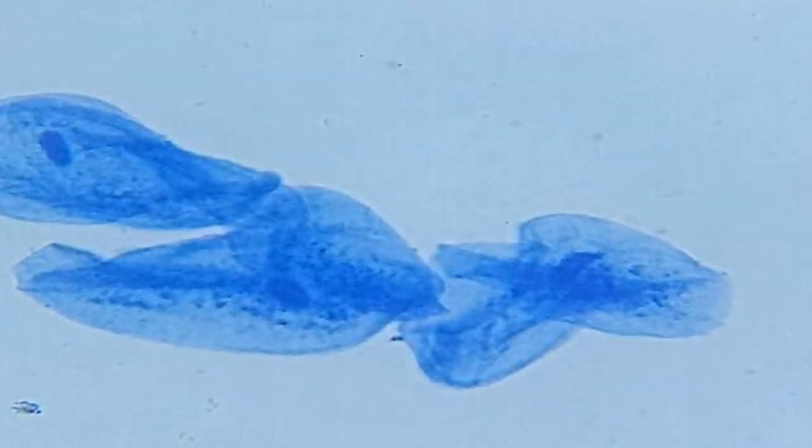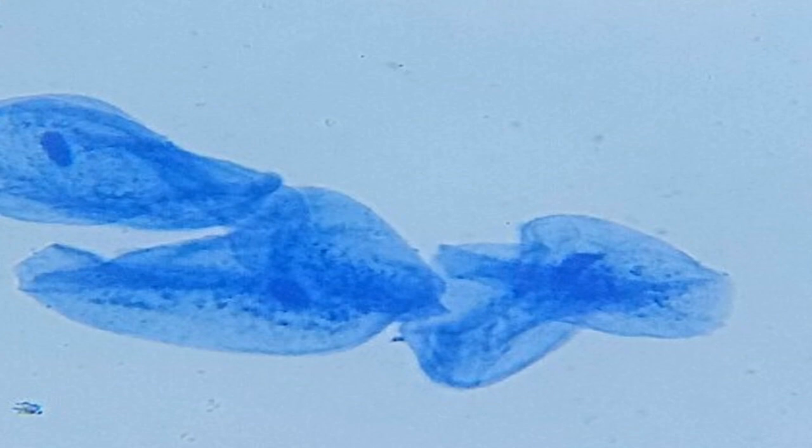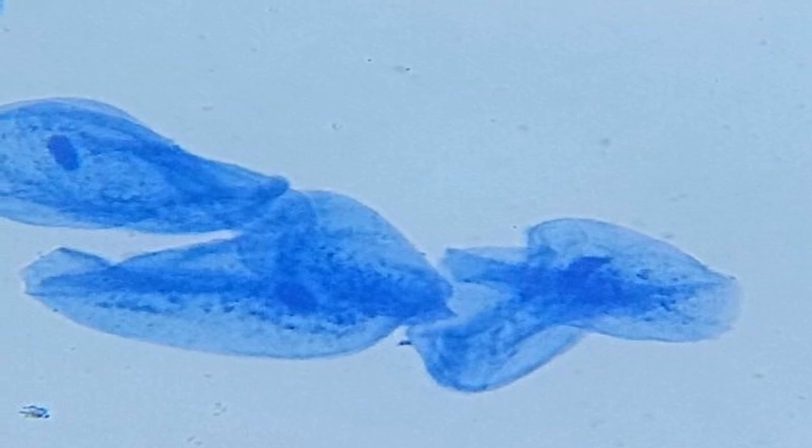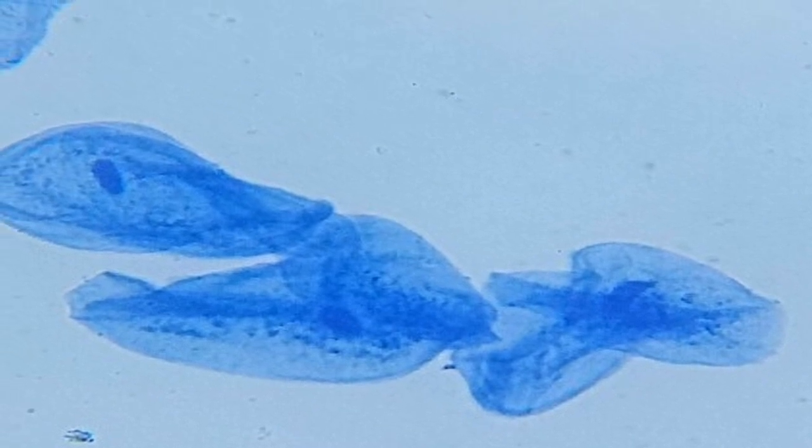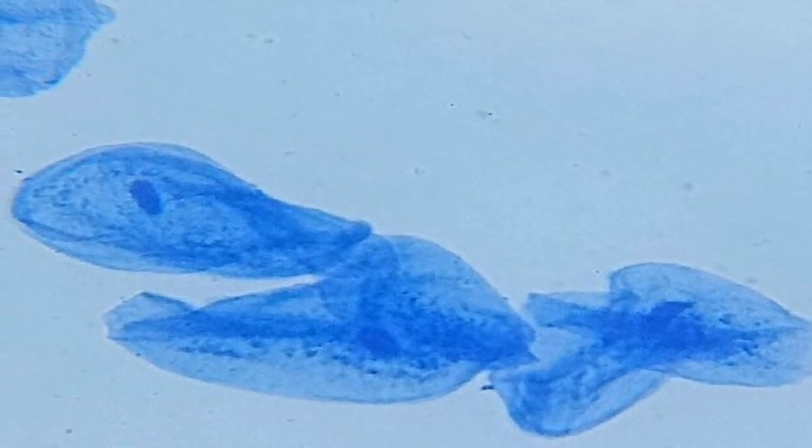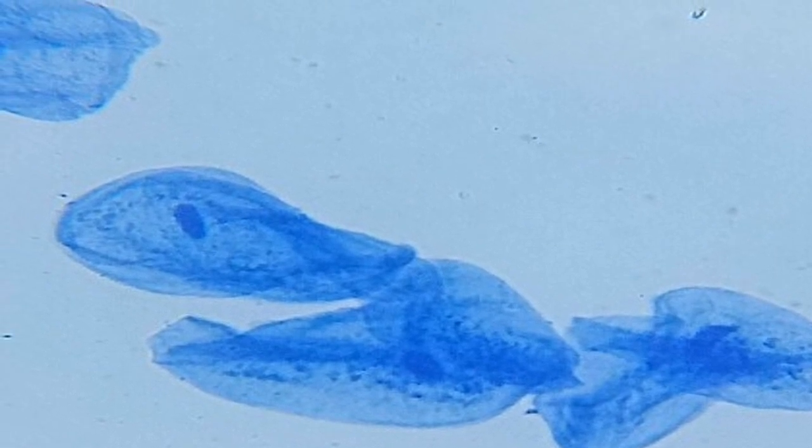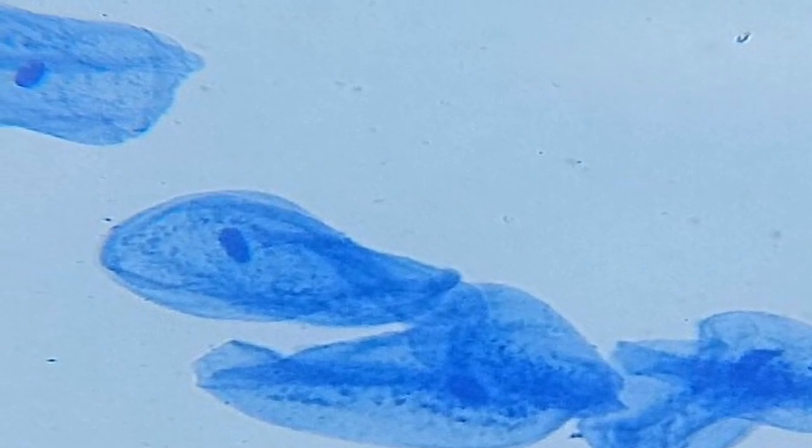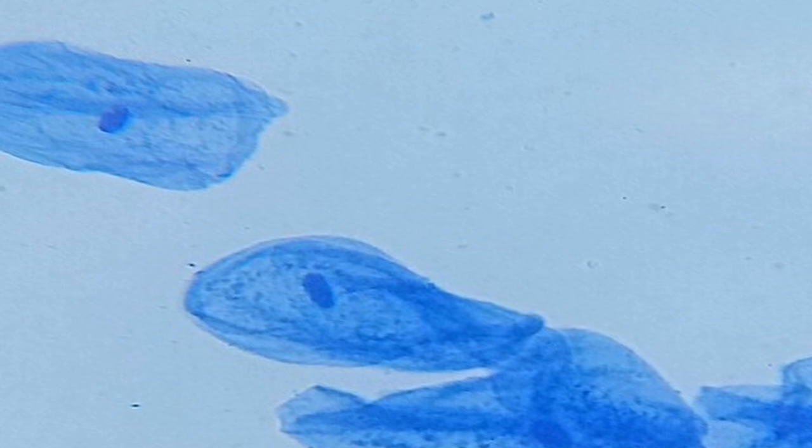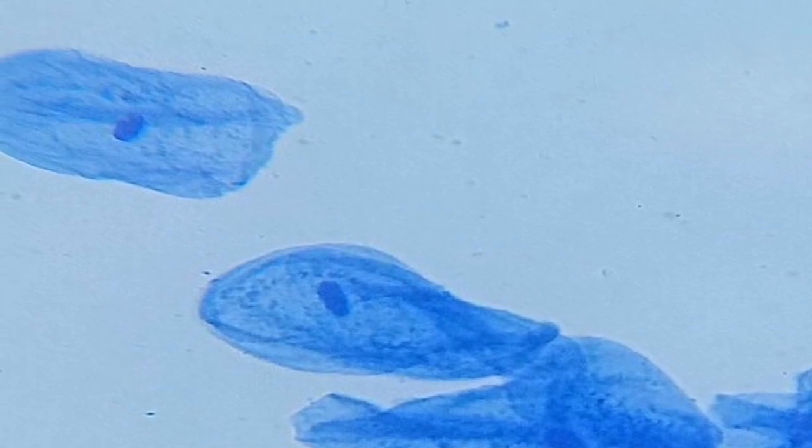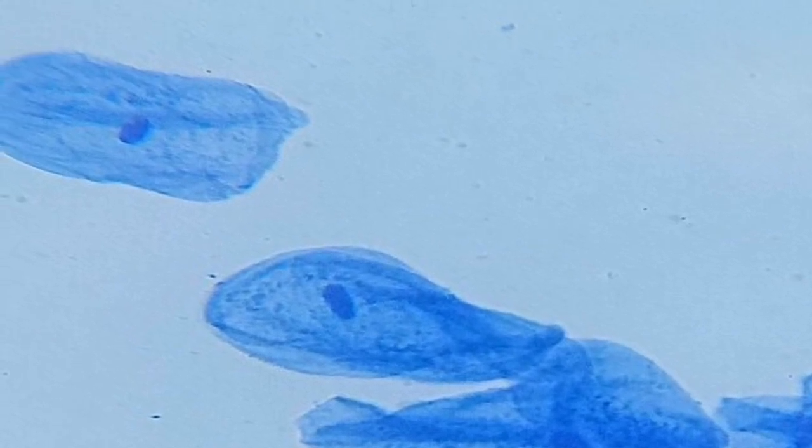What you should be able to view is something like this. Take note of the shape of the animal cells and how they appear jumbled randomly on top of each other, which we'll soon see to be very different to a plant cell. Thanks to the methylene blue we stained the cells with, you can clearly see the cell membrane surrounding the cells and the very darkly stained dots in the middle of the cells is the nucleus of each cell, which you'll remember from a previous video is where your DNA is kept.